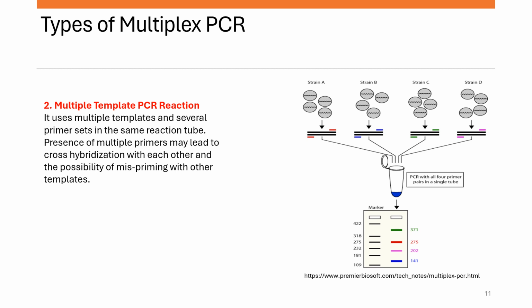Multiple template multiplex PCR reaction. It uses multiple templates and several primer sets in the same reaction tube. Presence of multiple primers may lead to cross-hybridization with each other and the possibility of mispriming with other templates.